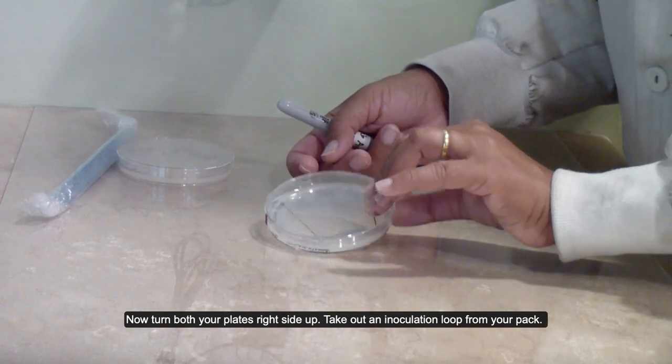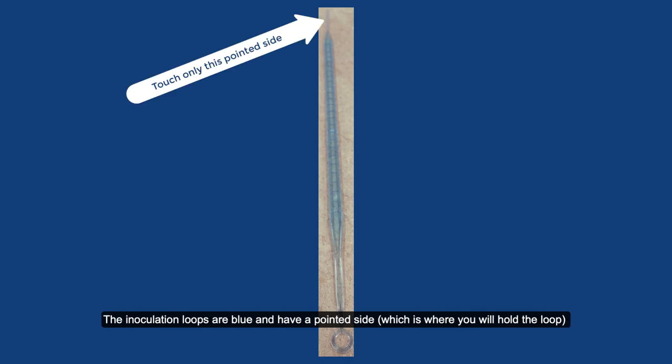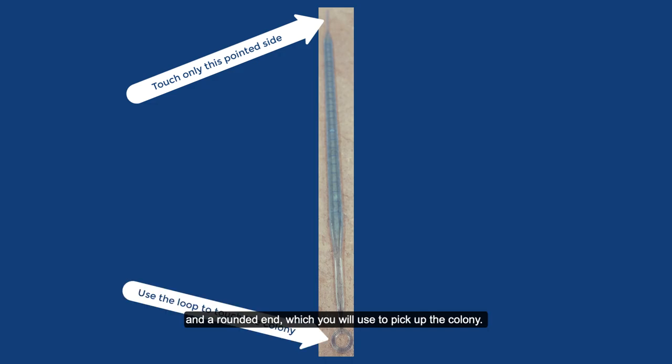Now, turn both your plates right side up. Take out an inoculation loop from your pack. The inoculation loops are blue and have a pointed side, which is where you will hold the loop, and a rounded end, which you will use to pick up the colony.